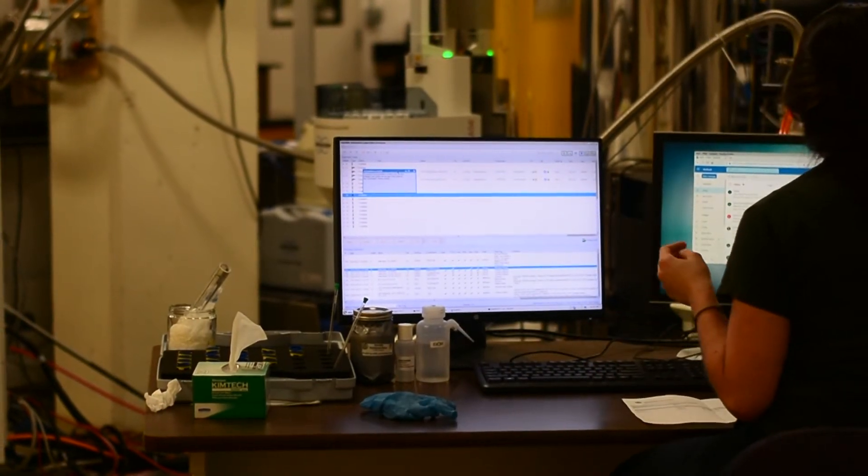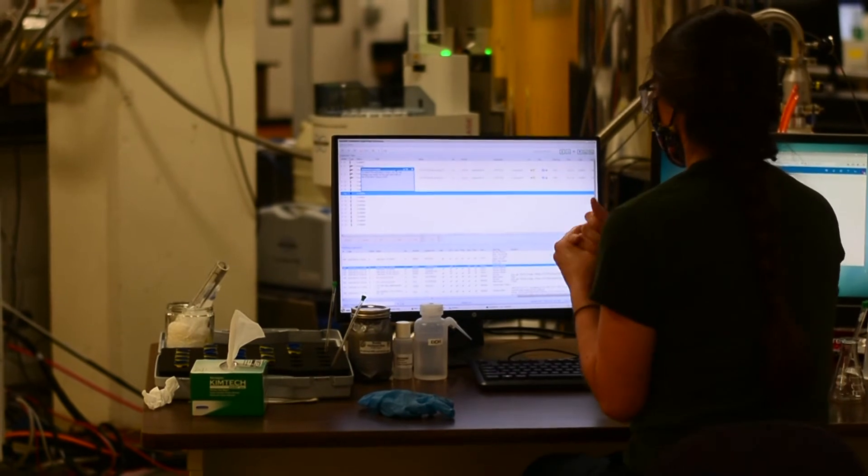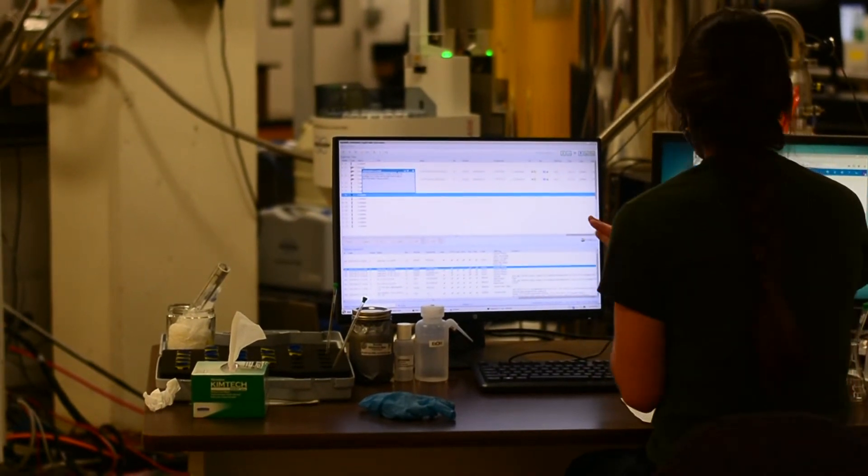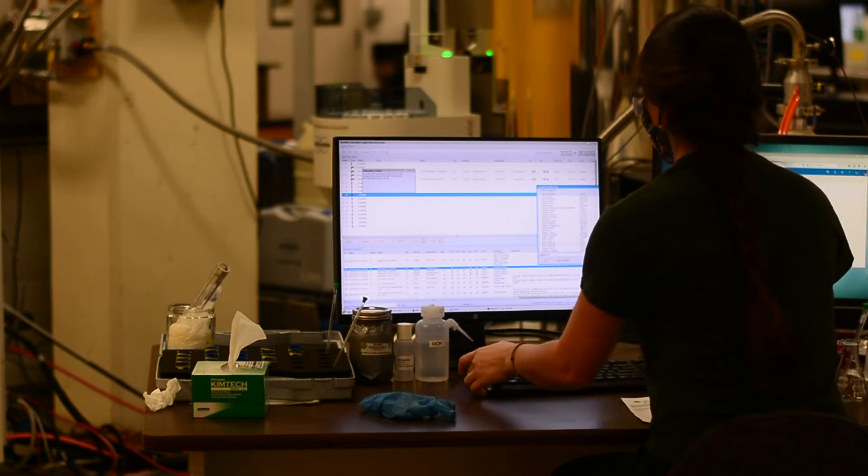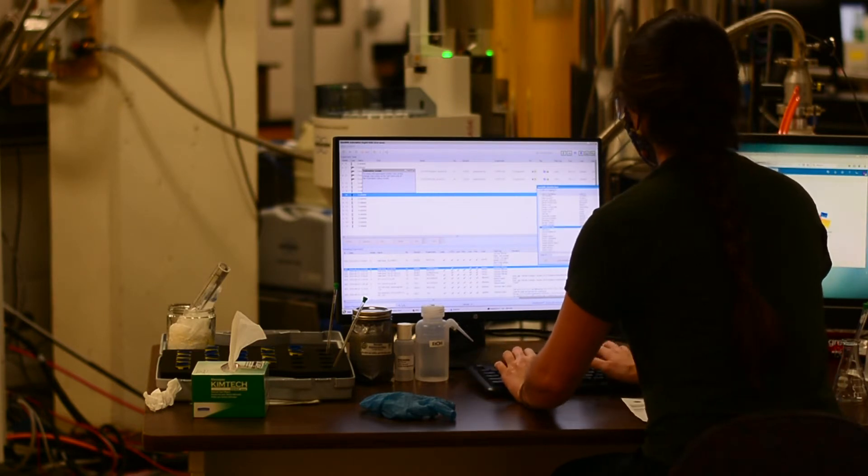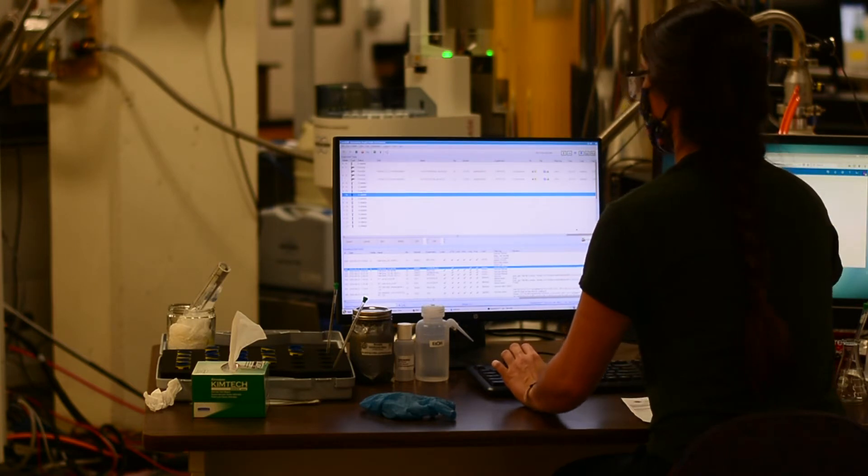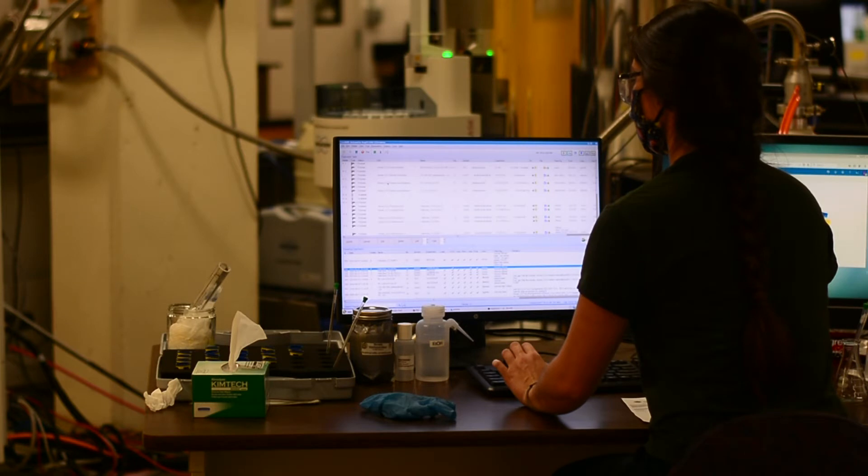Log in to your account. When you request this training, an account will be created for you, and it will be here when you come in to do your proficiency test. You'll find your e-name and put in the password which is lowercase nmr the number four and capital C capital S capital U.